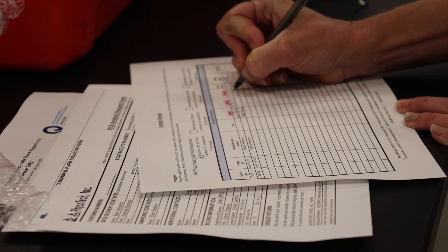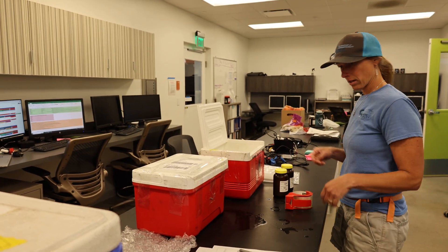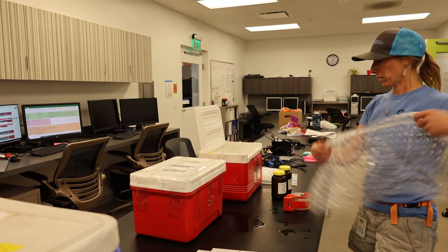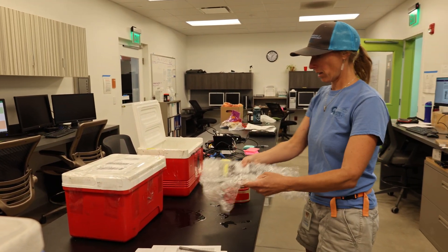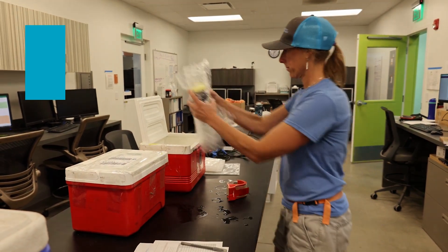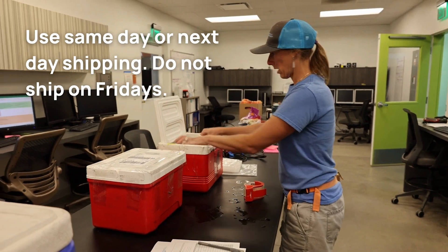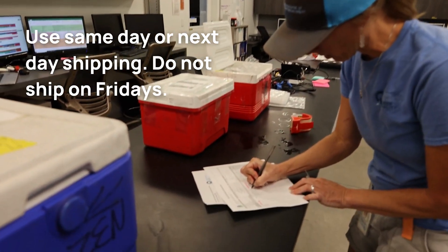Be sure the bottle labels match the information on the sheet. Pack the samples in a cooler on ice. Tape the cooler shut and attach the shipping label to the top. Toxins and cyanobacteria cells can break down quickly, so keeping them on ice and submitting them to the lab as quickly as possible ensures a good quality sample.